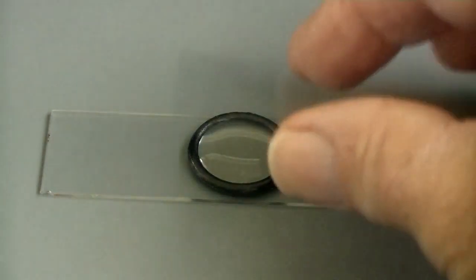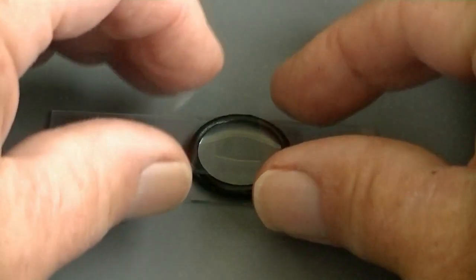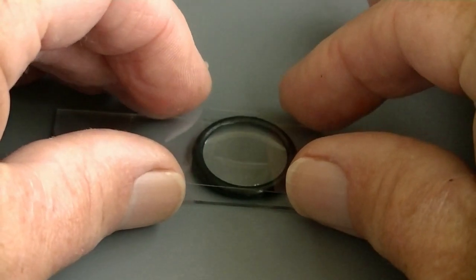Now gently lower the cover slip from one side, and expel any excess liquid from the other side.